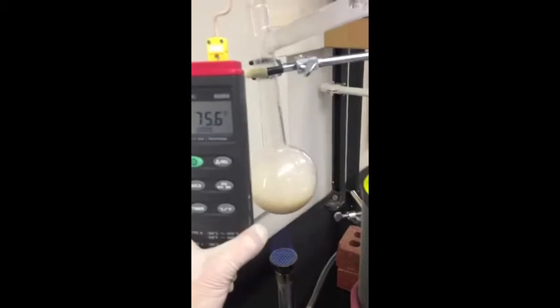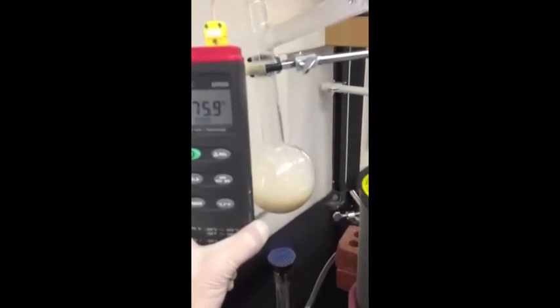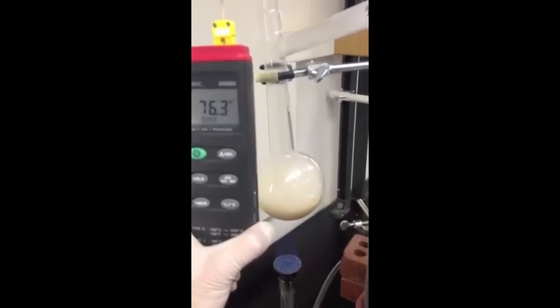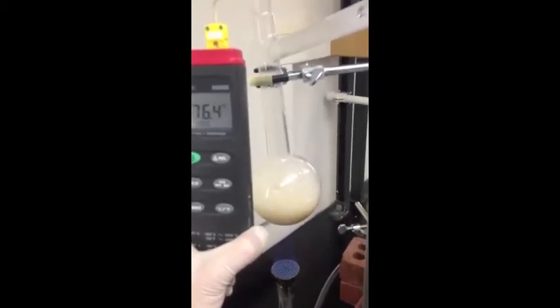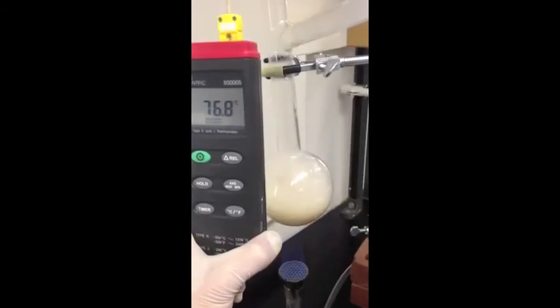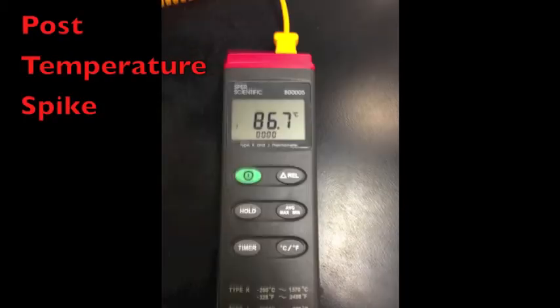During this time, ethanol of 95% purity is being vaporized from the solution and is being condensed and collected in the receiving flask. Continue to monitor the temperature. Eventually, it will spike. At this point, remove the heating source as you are no longer vaporizing ethanol. Continued boiling after this point will dilute the ethanol that is being collected in the receiving flask.